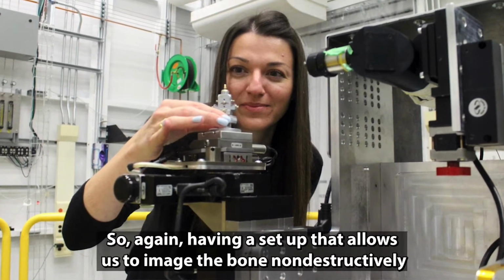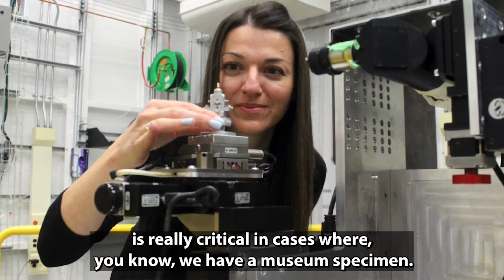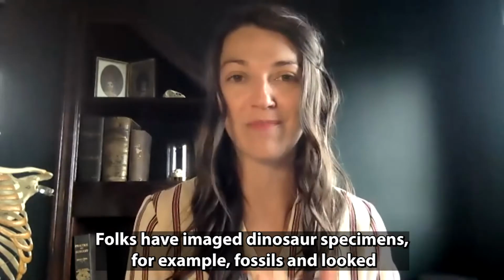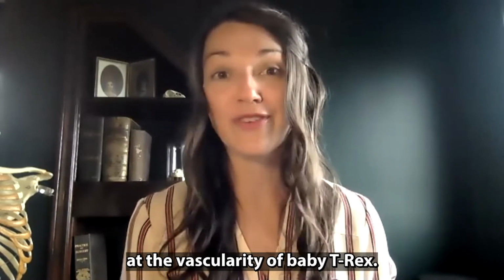Having a setup that allows us to image the bone non-destructively is really critical in cases where we have a museum specimen. Folks have imaged dinosaur specimens, for example, fossils, and looked at the vascularity of baby T-Rex.